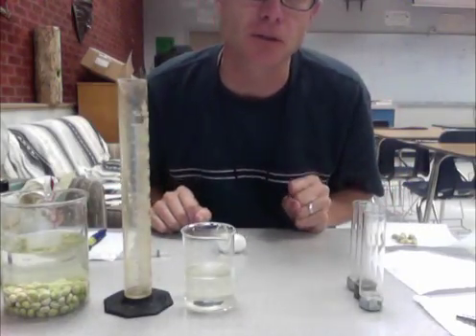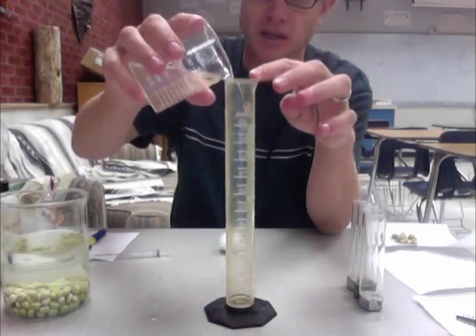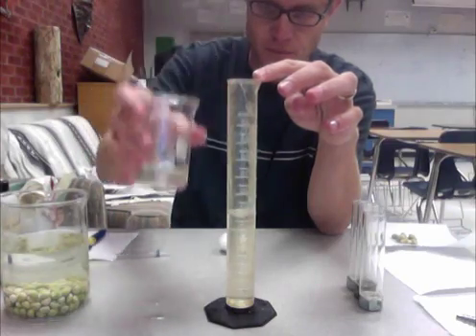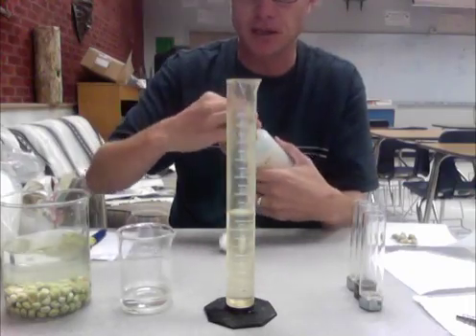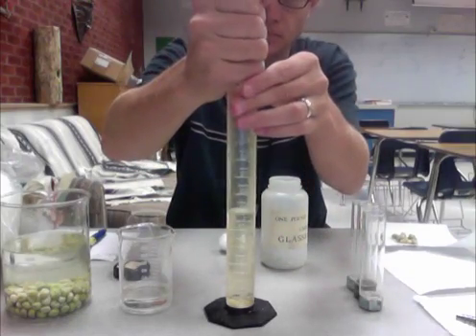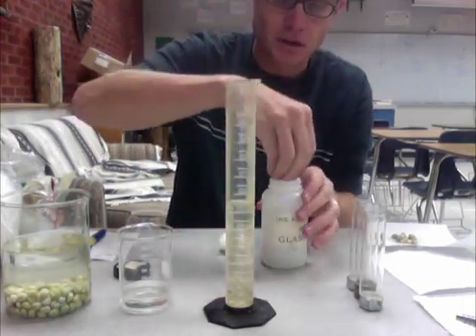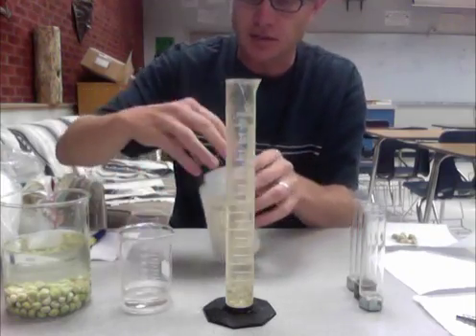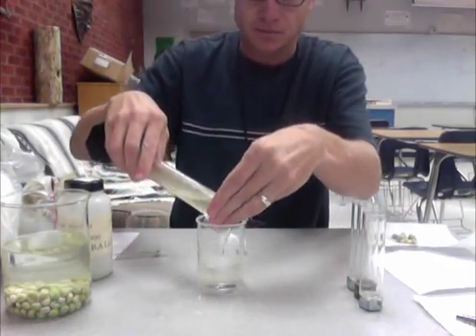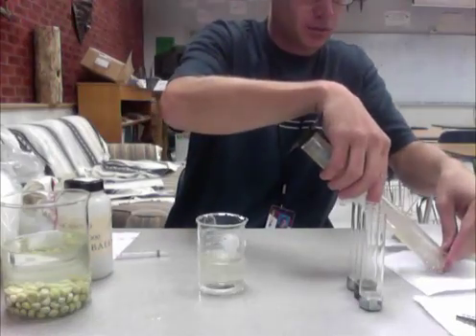Next, I'm going to get the same amount of glass beads. I'll pour in 50 mils again and then add glass beads until I have 7 mils as well. Now I've got 7 milliliters of glass beads, so I'll dump the water out and put those on one of the paper towels.